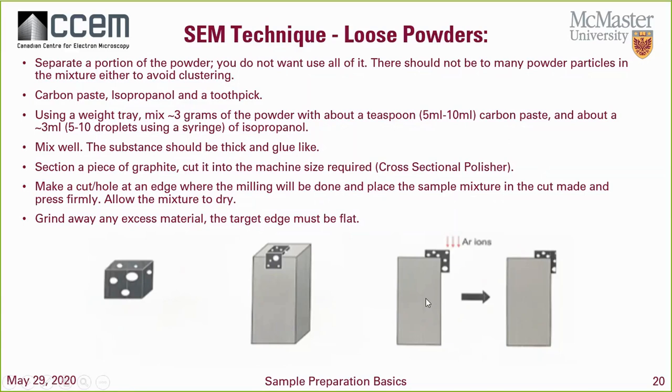Now, I want to emphasize glue-like a little bit, okay? Because you don't want it to be too sticky. You want it a little bit grainy, but you want to make sure that it sits in this area very well. Now, in my pictures down here, you can see you have a height protruding here. We don't want that, okay? So we want to make sure that we remove this excess material because we want to grind right on the block. So the block here is a graphite block that I've sectioned. I cut a piece of it, and this is my mixture or my powder.